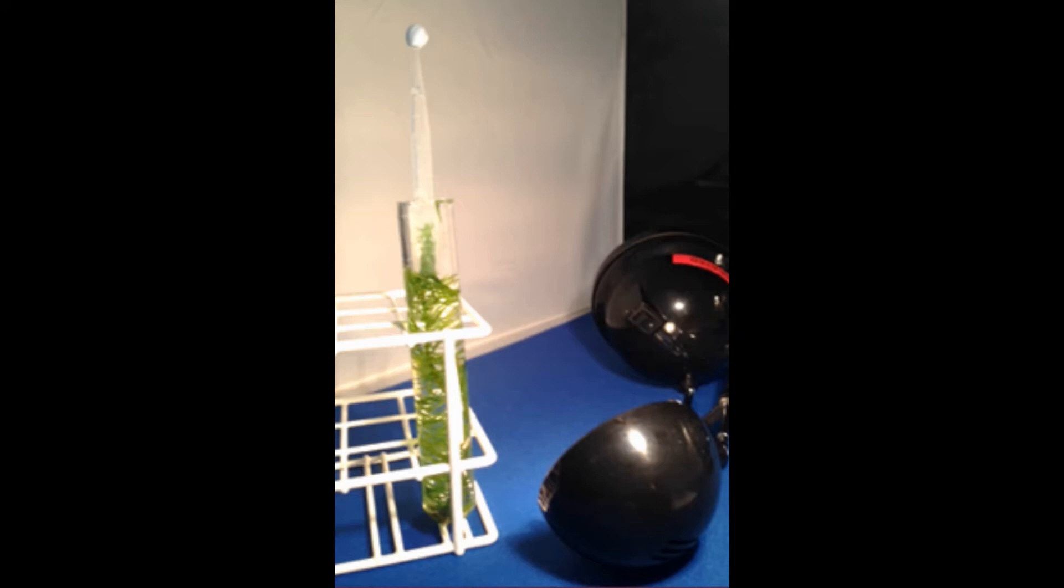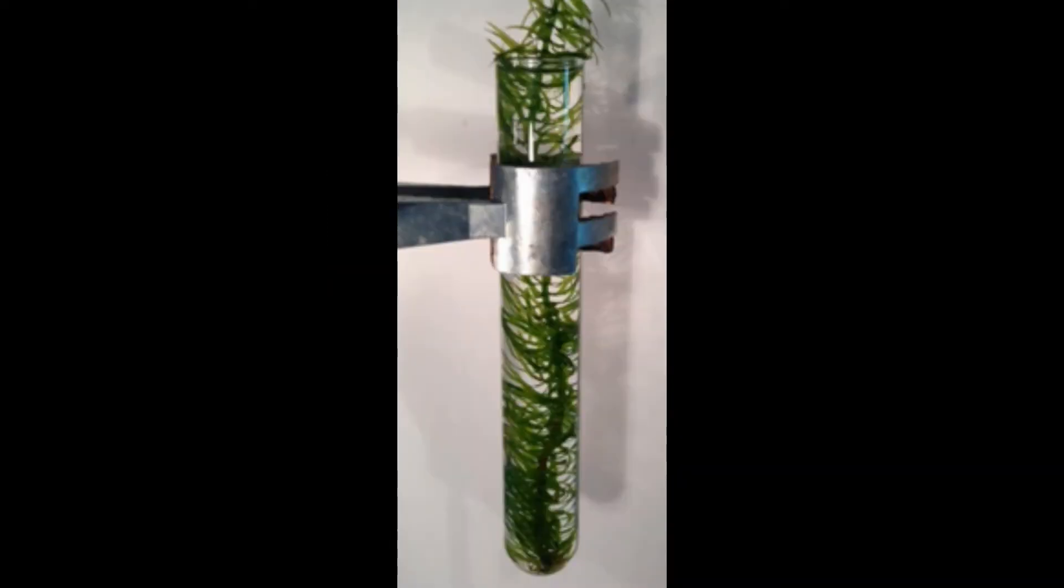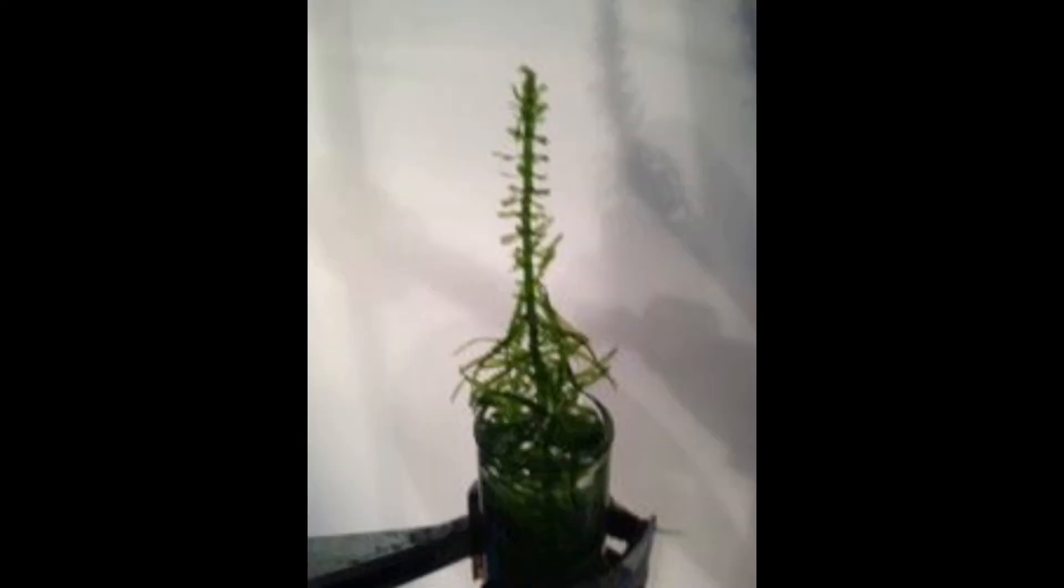To carry out individual investigations into the rate of photosynthesis, students could make their own mini-bubblers. To make a bubbler use a piece of Egeria which is at least equal to the length of a boiling tube and place the plant in the boiling tube stem end upwards. Trim the leaves exposing the final 3-4 cm of the stem.